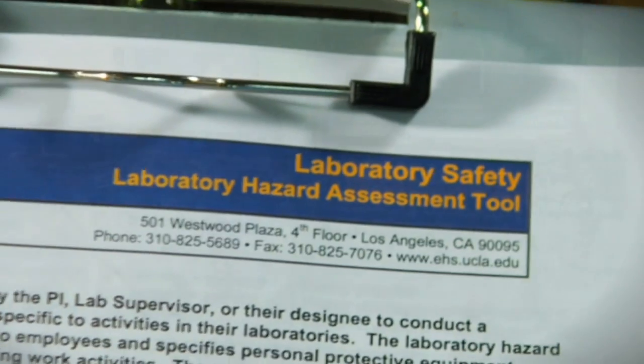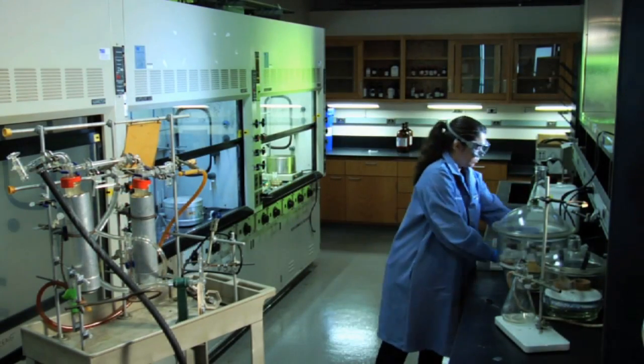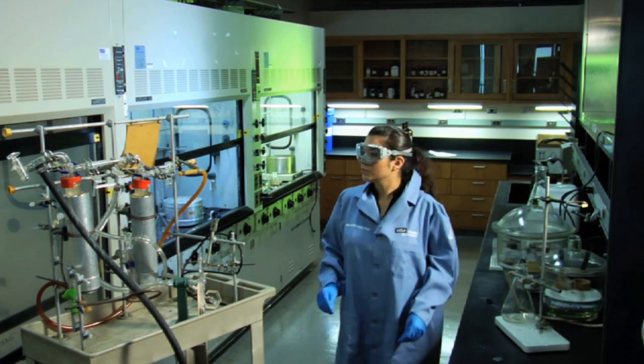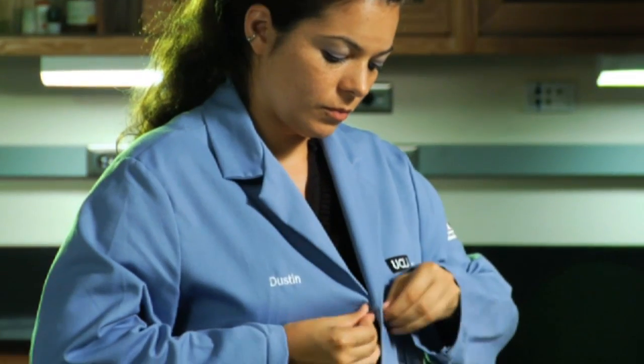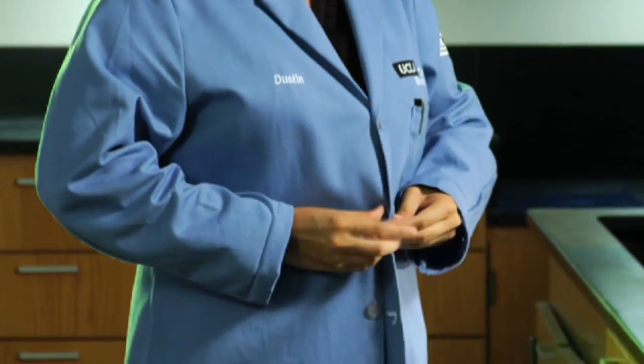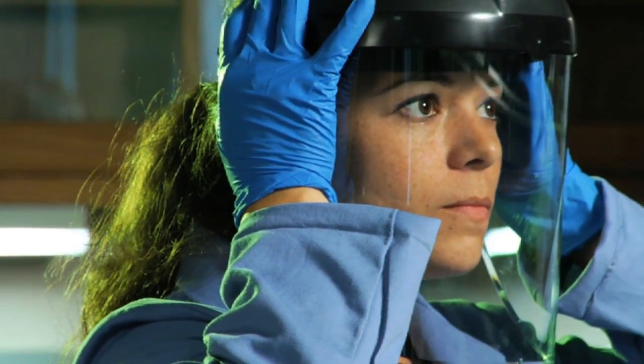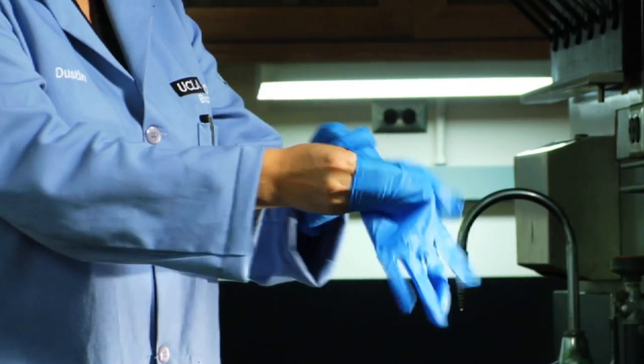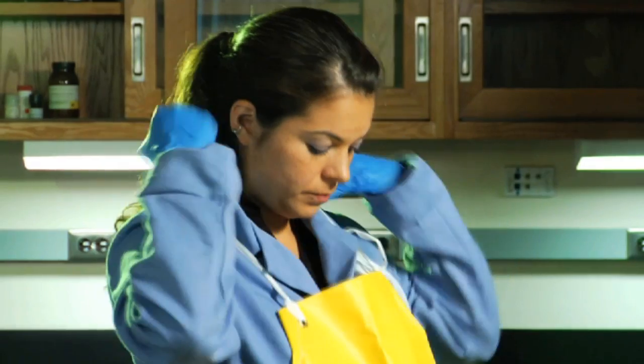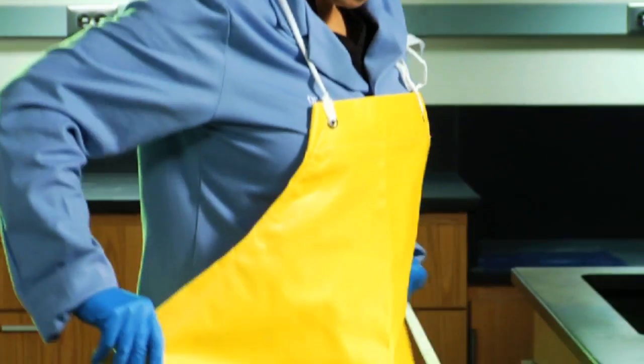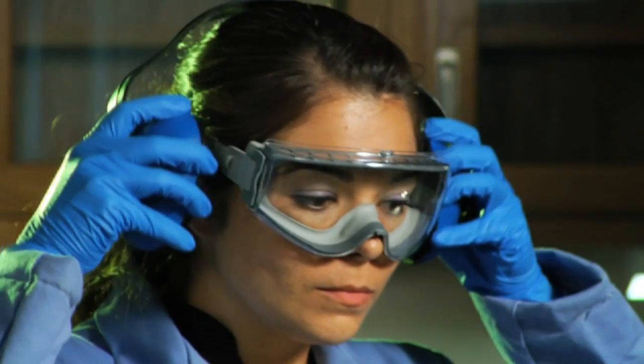Utilize the EH&S Laboratory Hazard Assessment Tool to identify the PPE that corresponds to hazards associated with your particular work area. Always wear the proper PPE for the work you are doing. Laboratory PPE includes a properly fitting lab coat. For some procedures, a fire-resistant lab coat may be necessary. Face and or eye protection. Gloves of the correct size and type for the hazard involved. A chemically-resistant apron when necessary. Other lab or hazard-specific PPE items may be necessary, such as respiratory or hearing protection.